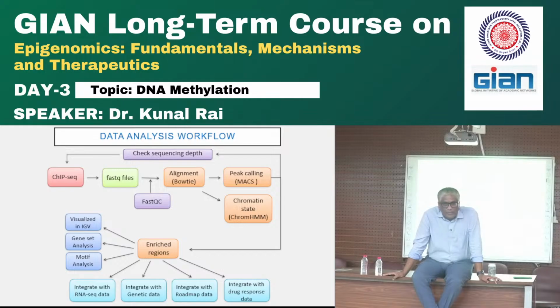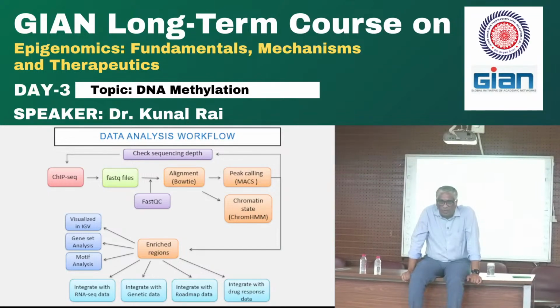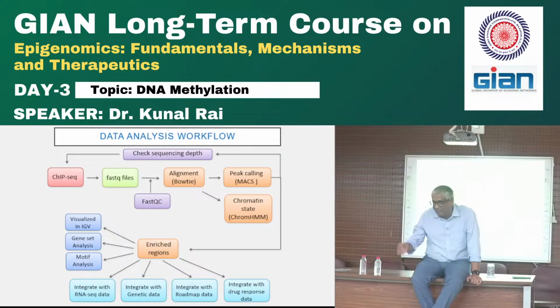Okay, I can go into more detail. It needs to be in a range where you have saturated it, because if you don't saturate it, you're likely to find wrong information, and you compare two samples from each other because one may not have sequenced enough, other may have, and then you would get wrong answers in terms of comparison. I don't think most of you got what I just said. People who got it are very smart or are my wavelength people, according to my numerologist, right? No, seriously. It's tough to explain, actually. I can explain it. It's just that I'm lazy.